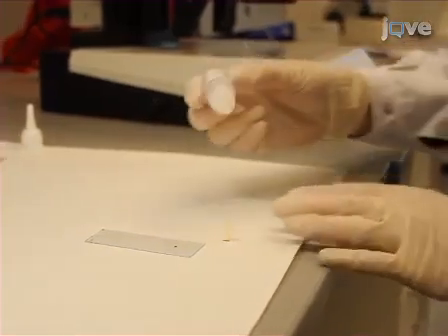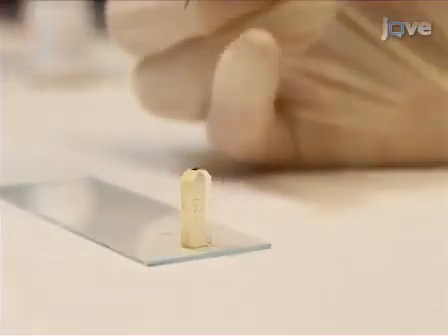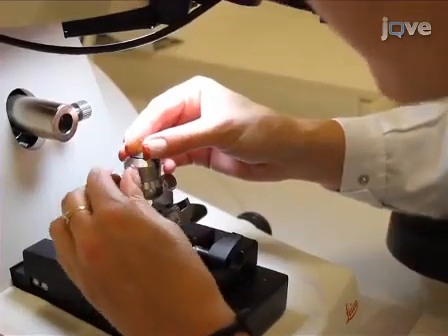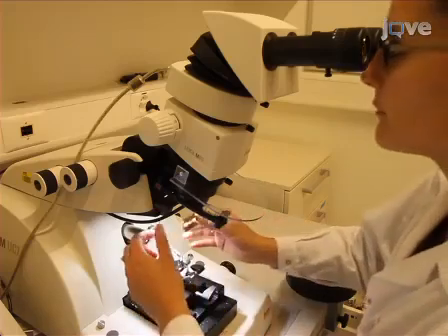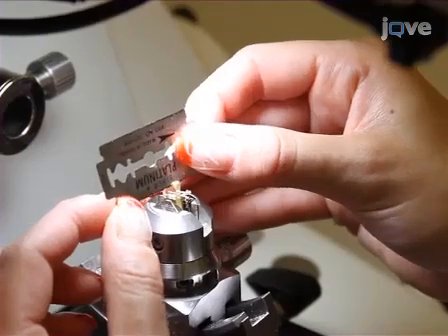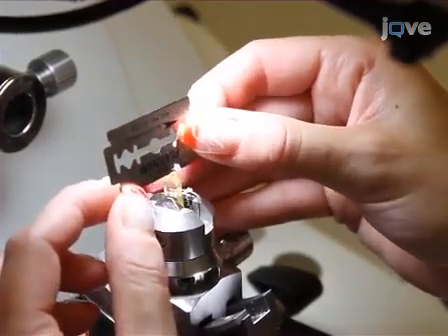Use acrylic glue to attach the small resin block to the top of a blank resin block. Next, clamp the block into the holder of the ultramicrotome. Looking through the attached stereo microscope, use a razor blade to trim around the region of interest until only a small pyramid of material remains.